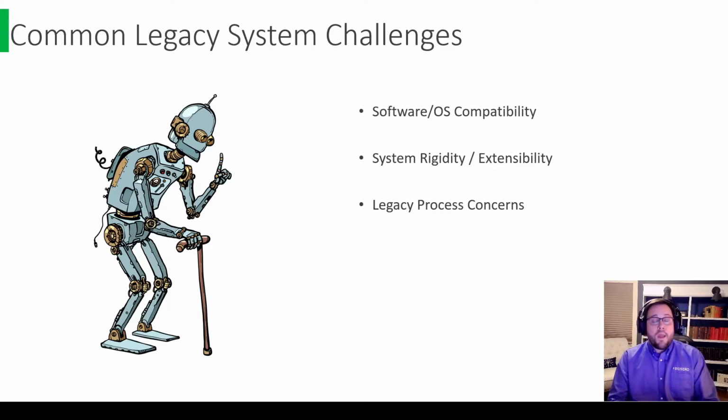So the way we get around that in GBG is by any individual instruments that need to be connected to Windows 7 can still run off of that system. We'll just isolate that from our GBG computer by using the GBG remote client to run a smaller, more light version of GBG on the Windows 7 machine, so it's still connected to GBG, but is isolated from the network, which is, pursuant to most IT guidelines currently.